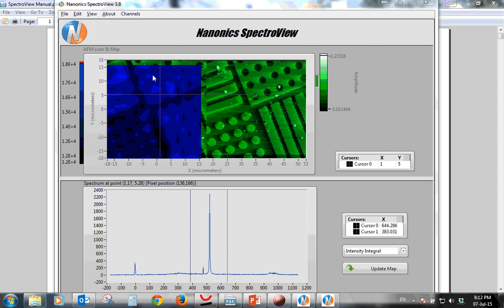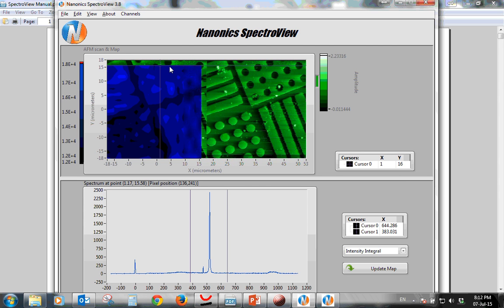Okay, so here is the map of the different acquisitions. We can look at different points. Okay, this is now the cursor. Now here is 1, 9. Okay, 116 different points, and down here on the lower scope, we can see how the spectra looks at different points.